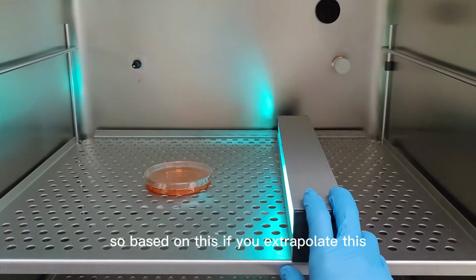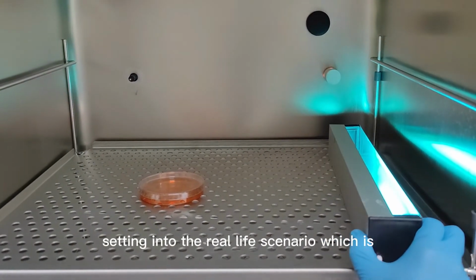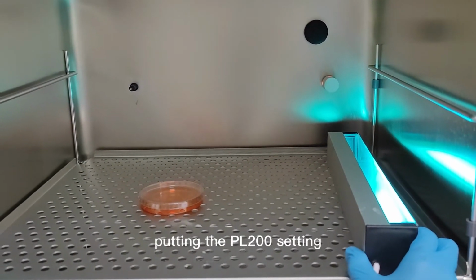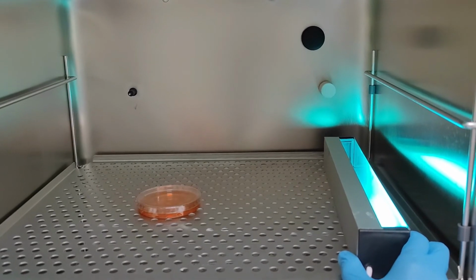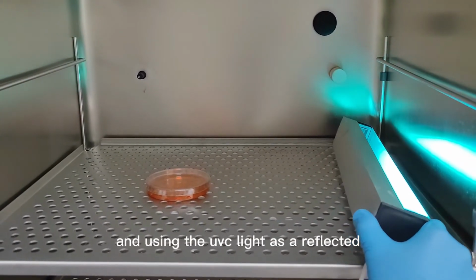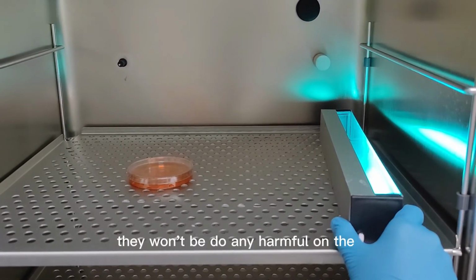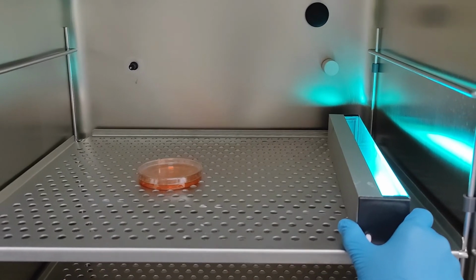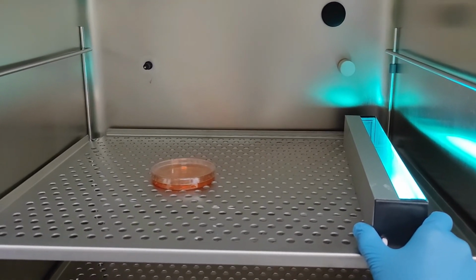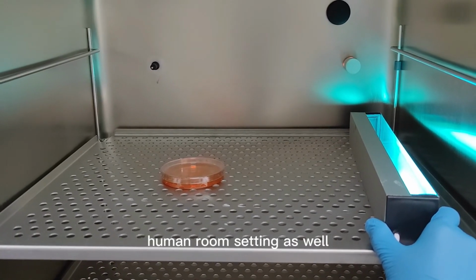So based on this, if we extrapolate this setting into a real-time scenario, which is putting the PL200 at 1.5 to 2 meters and above, and using the UVC light as reflected light in the room setting, most probably it won't do any harm to the human cells themselves. Obviously, this needs to be tested in a human room setting as well.